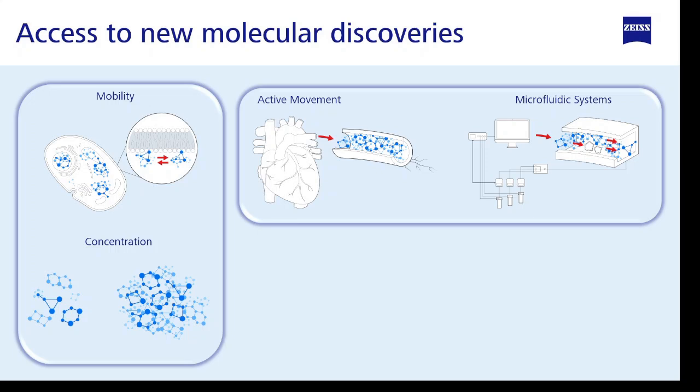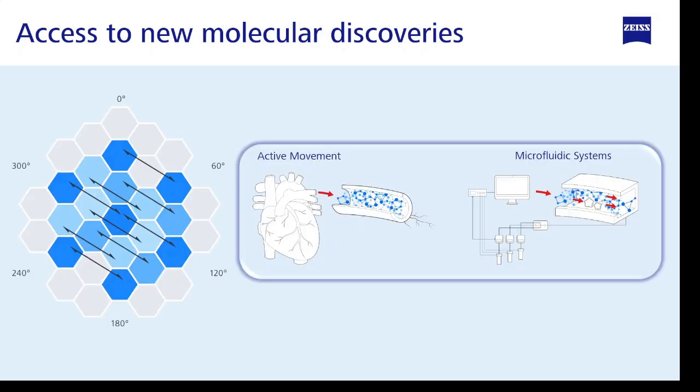This information is very important for studies of the active movement of solutions, like bloodstreams, or applications in microfluidic systems.